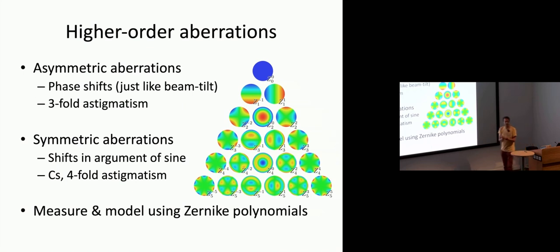Okay, so in RELION we use Zernike polynomials to describe these images, both phi and psi. So both the antisymmetrical and the symmetrical terms of this CTF model are described by these Zernike polynomials. And again, we compare reference projections with this model against the noisy experimental images, now not on a per-image basis, because that would be too noisy and there's not enough signal, but averaging over many images from what we call an optical group. That might be all the images in your data set, or the images on day one until you decided to change the alignment of the microscope on day two, for example.